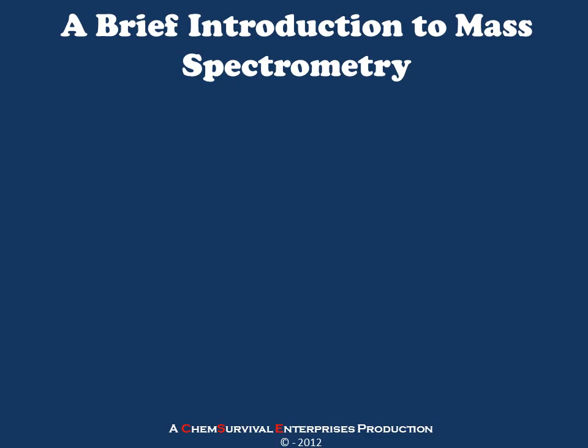Welcome to a brief introduction to the principles governing mass spectrometry. We're going to show you a very basic mass spectrometry experiment and how these instruments function, keeping in mind that there are many different ways to accomplish the goals that I'm about to show you.